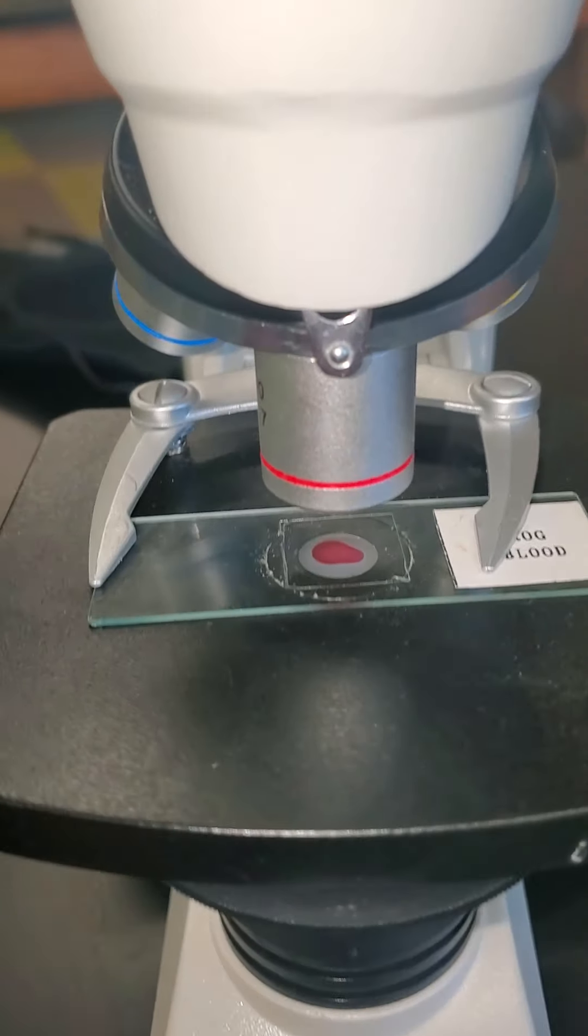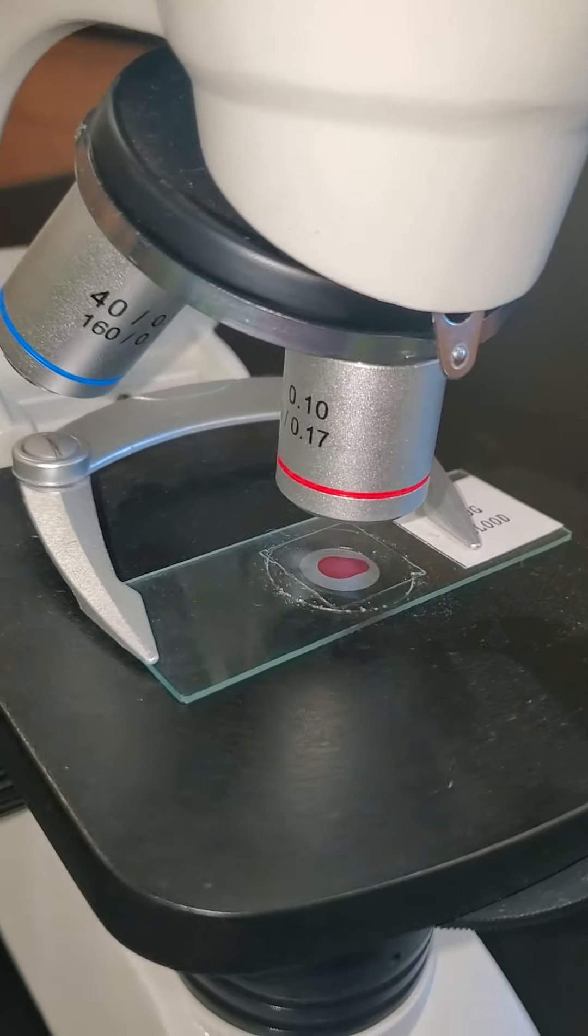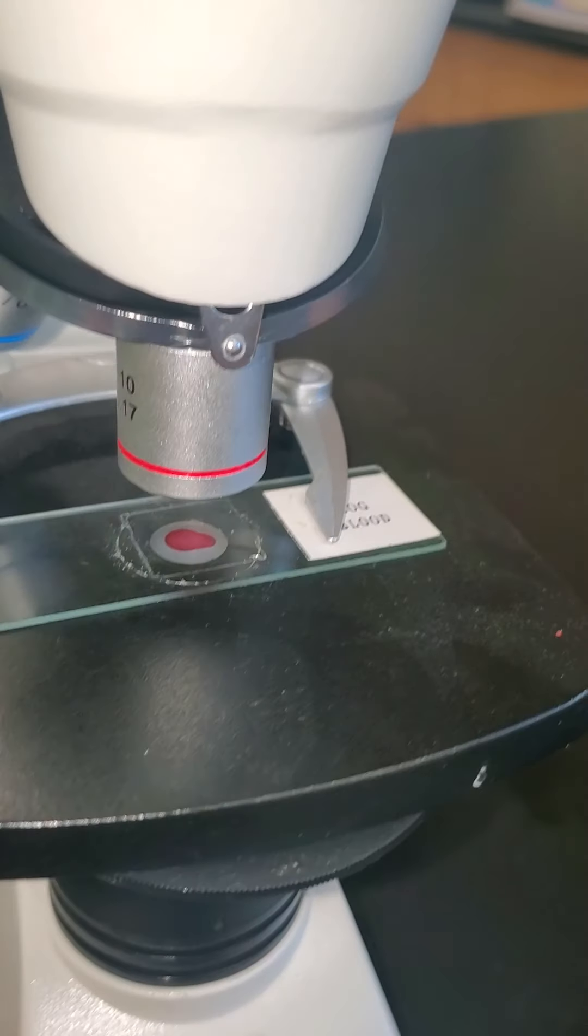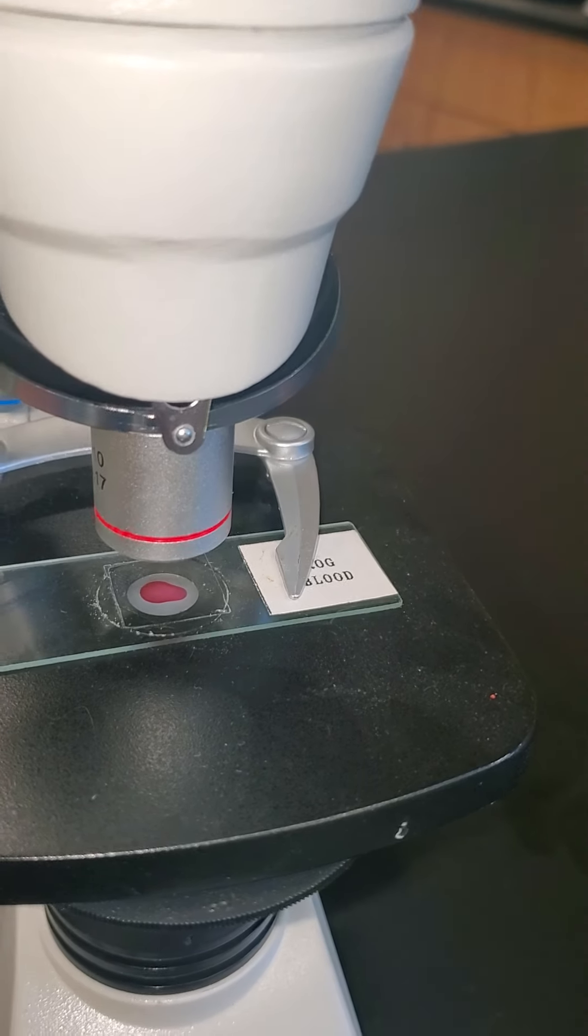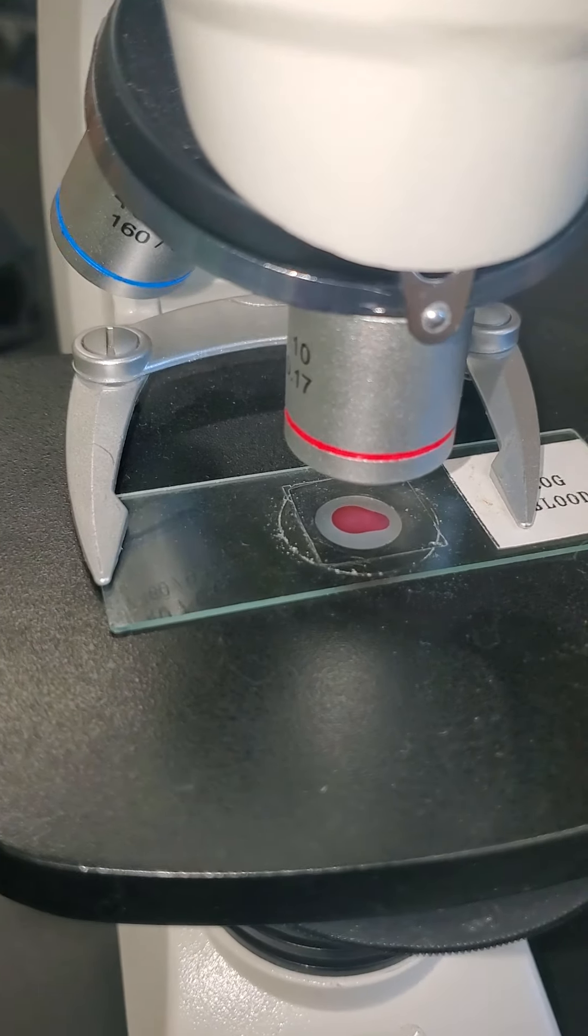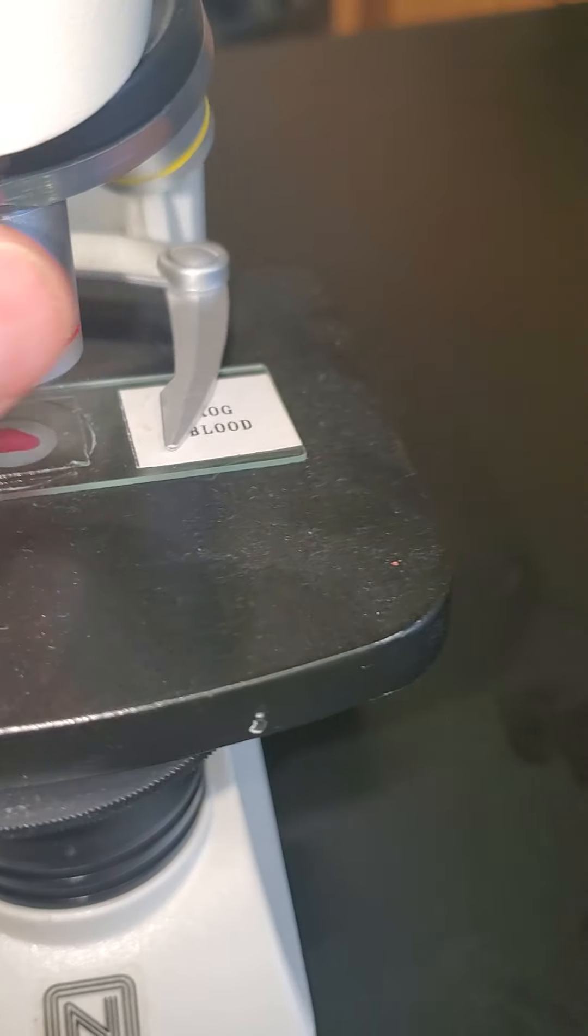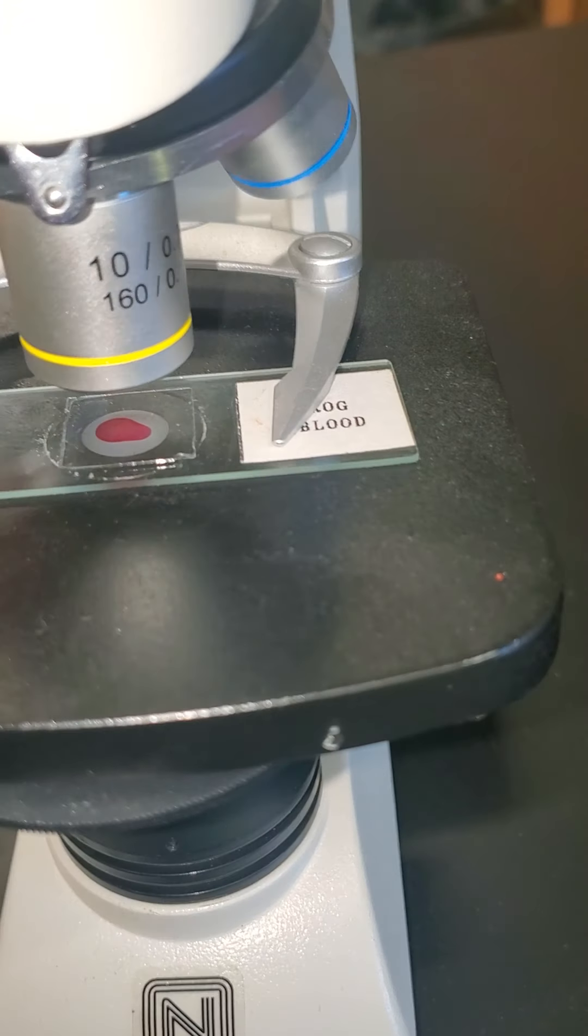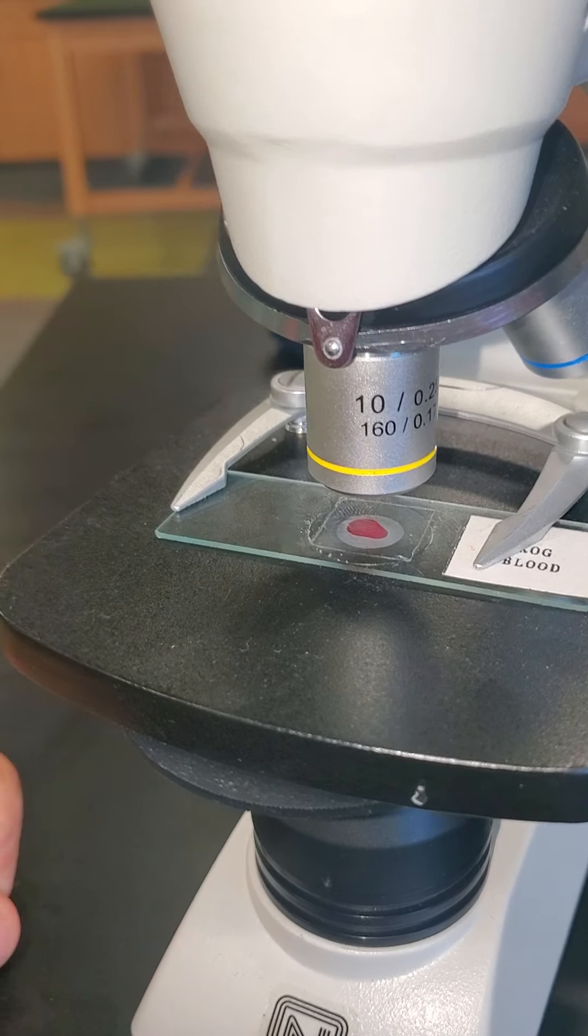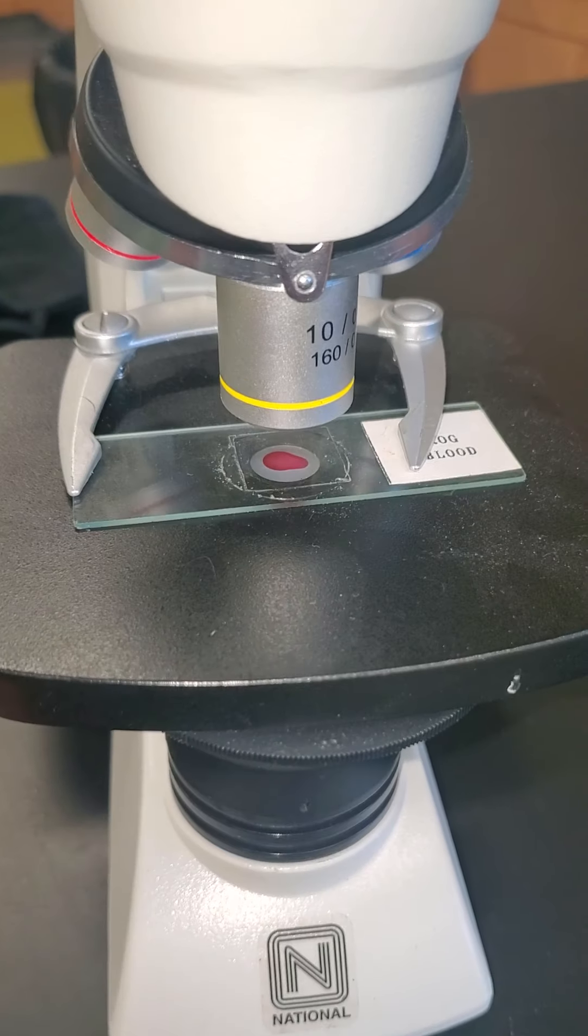At that point I always start with the red four times magnification lens so that we can see that our image is centered in the lens. Once we get a good view of that, we can up the ante a little bit with a more powerful lens and get a good view of what we are looking at.